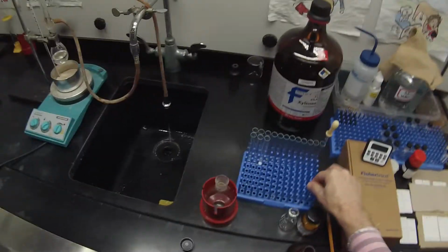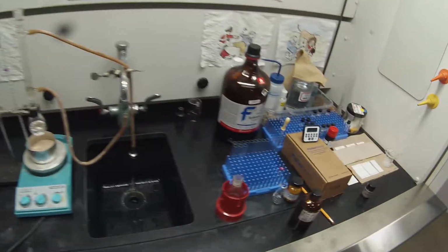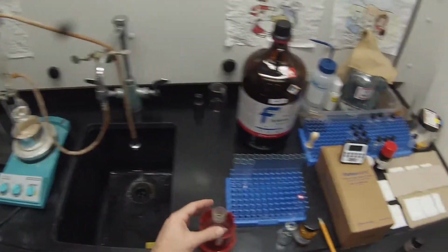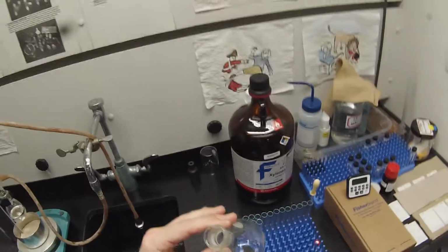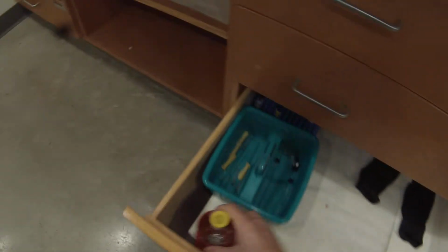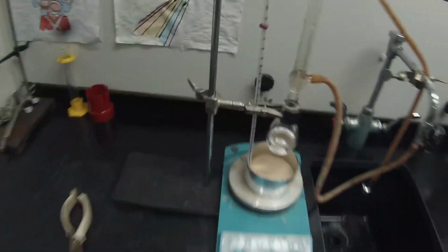So we'll set that aside. And now I can stopper this back up. We've got plenty more material. Guess I have to run this reaction again. Get that put away. So up around 140. I'd like that to stabilize a little hotter than that.